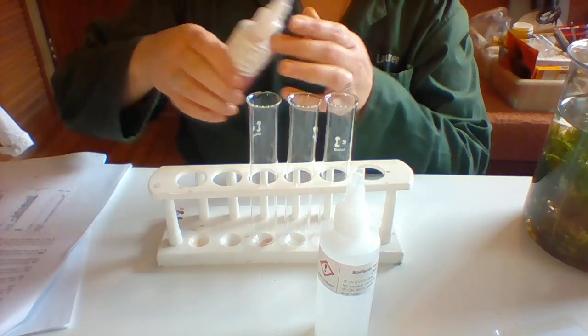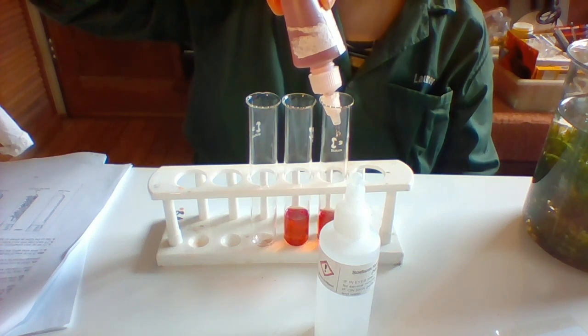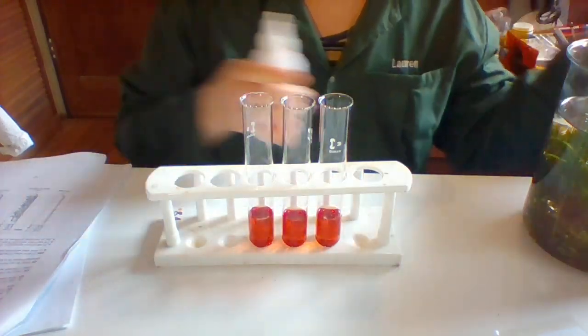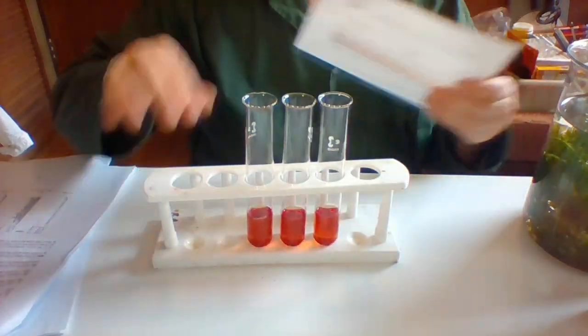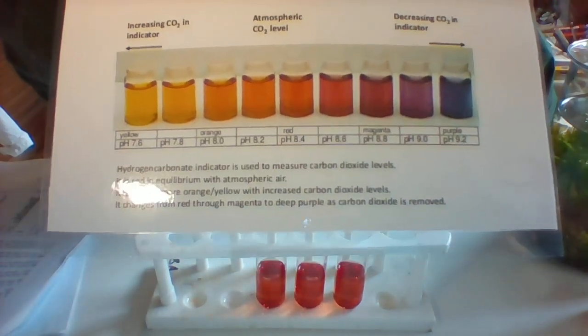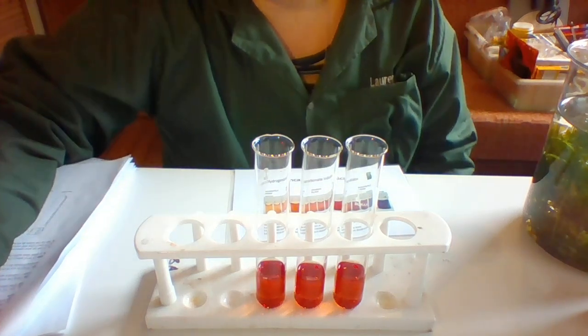So I'm going to pour some in a couple of tubes. All right, so you can see the color is all the same. And I'll show you this indicator chart, which you should have a copy of. But yeah, I wonder if you can see what pH that is right now. If you need to pause that, that's fine.